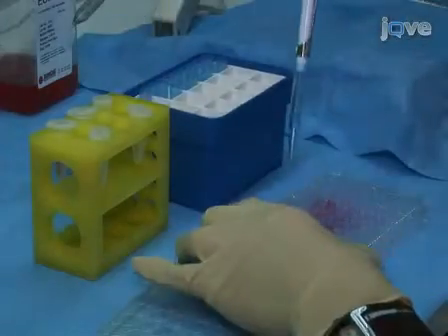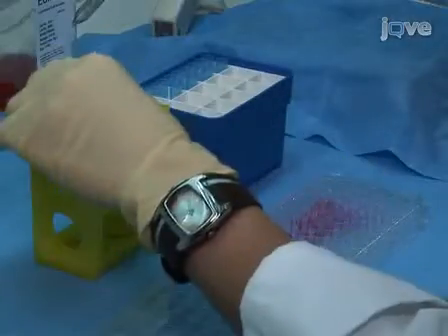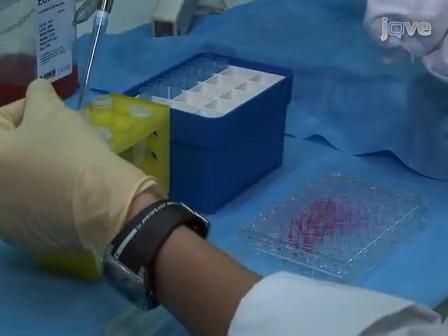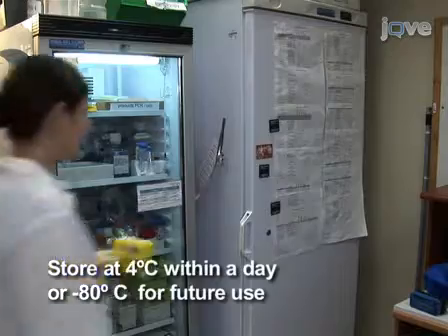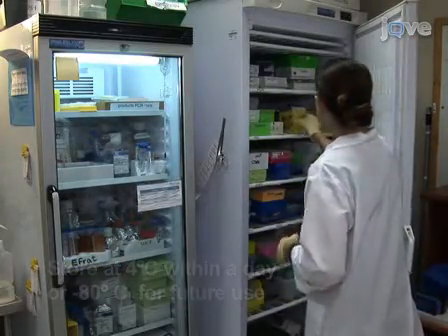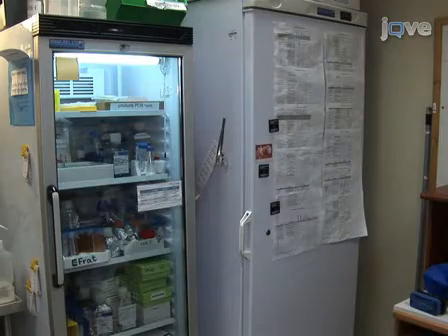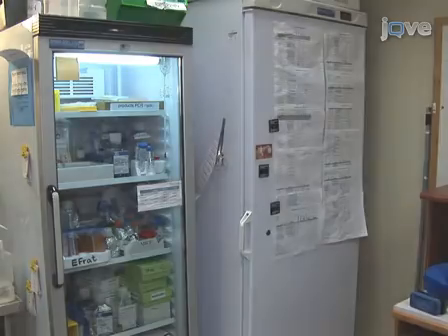In addition, collect supernatants on various days between day 6 and 12, and store at 4 degrees for use within a day, or aliquot and store at minus 20 or minus 80 for future use. The supernatants can be analyzed by various techniques, such as ELISA for VEGF or Griess assay for nitric oxide levels.